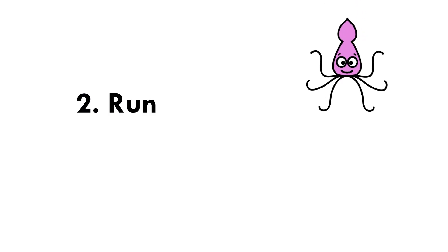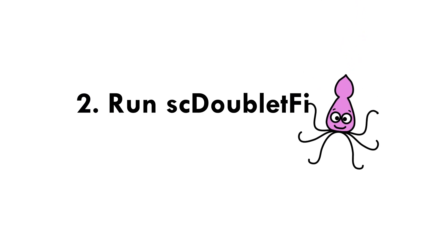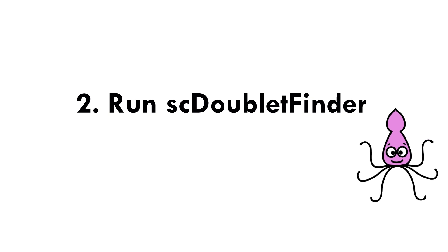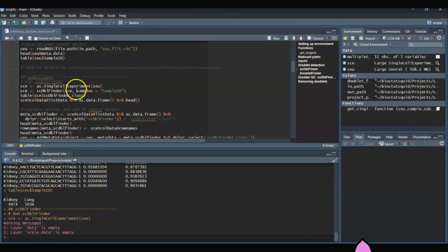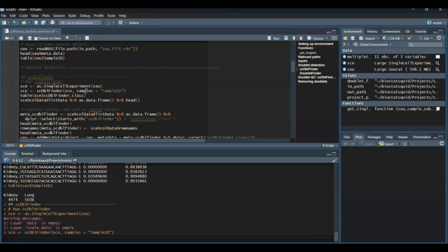Next, we will run scDoubletFinder. We can do this really easily by just using the function scDblFinder, as you see here, and the samples parameter is used to specify the column that has the sample IDs. In my case, it's called sample_ID.